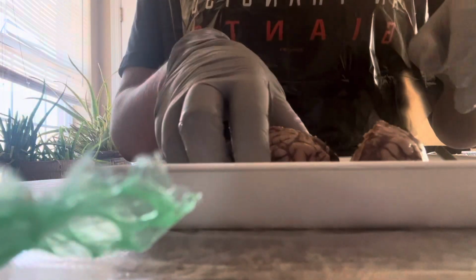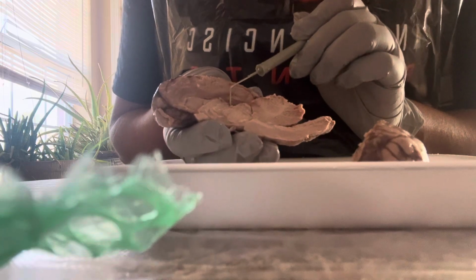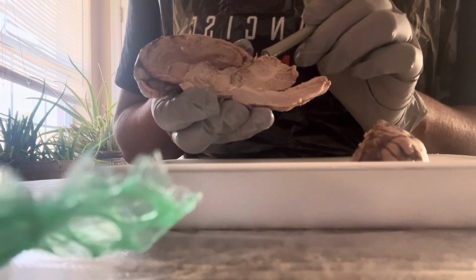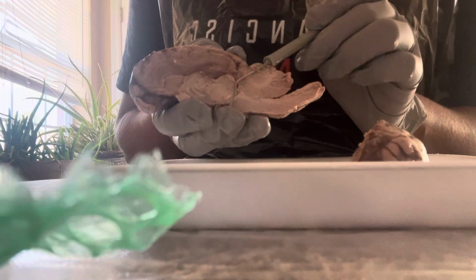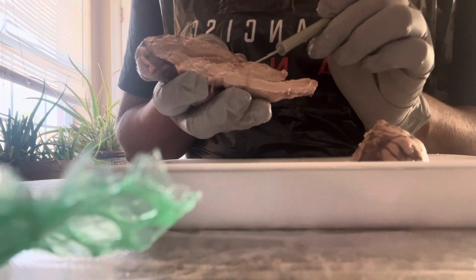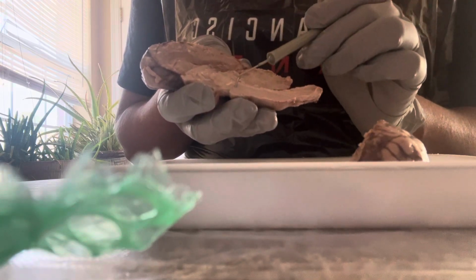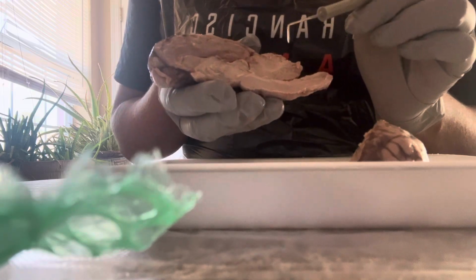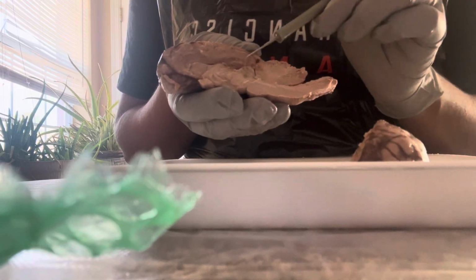If we go over to the hypothalamus, it's going to be underneath. So the thalamus is more towards the top, and then the hypothalamus is more towards the bottom. And the hypothalamus maintains homeostasis, the internal balance, by keeping the body stable. Moving over, of course, we've got the pons, and that's more towards the bottom here. And the pons are known to contain nerve tracts that connect the cerebellum with the brain and spinal cord. Keeping in mind that the cerebellum is here, the spinal cord is here, so this pretty much is what keeps it together.